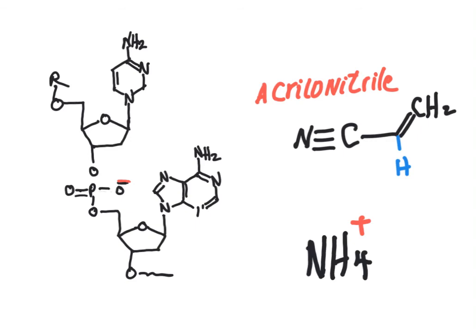The process repeats, and this is an efficient method of addition step by step that allows the addition of 70 to 80 nucleotides. DNA synthesis facilitates the synthesis of primers for PCR, is useful for gene therapy and other methods.